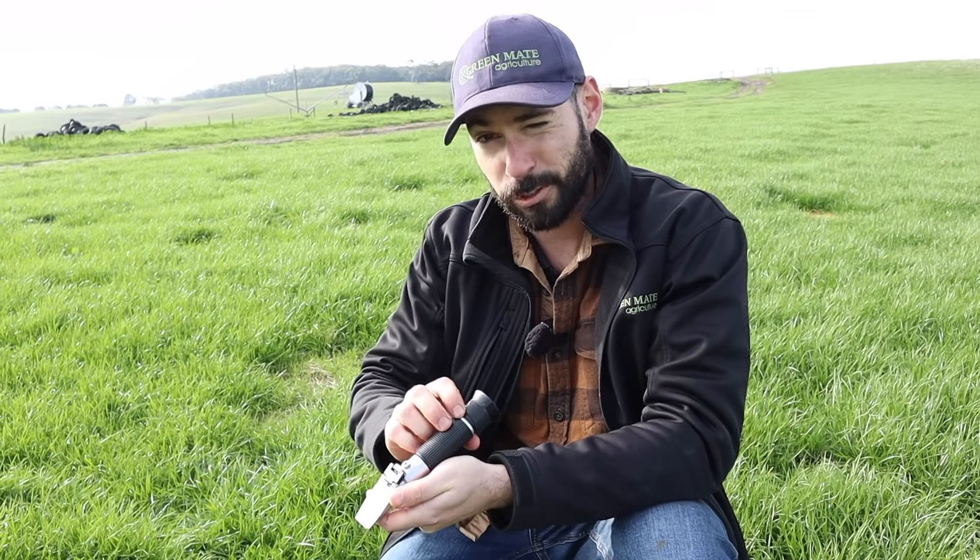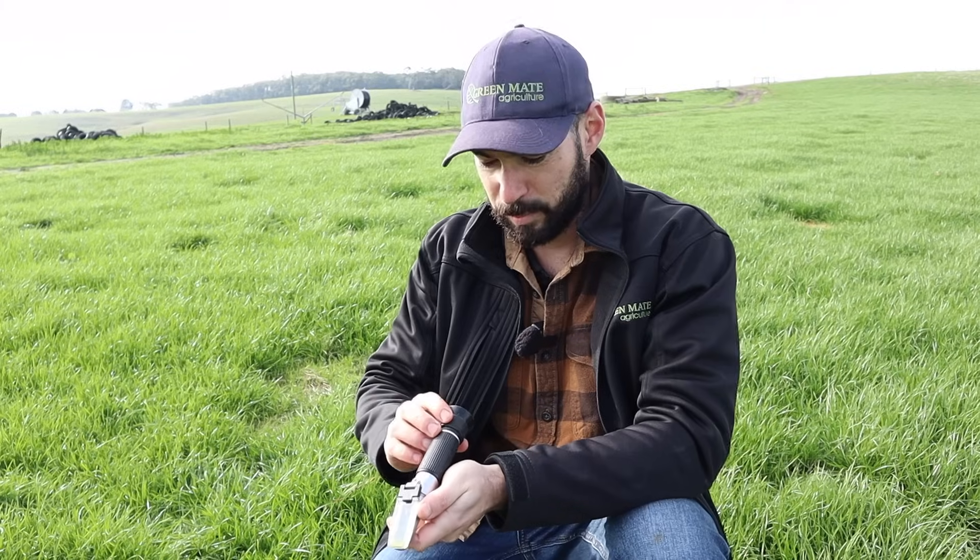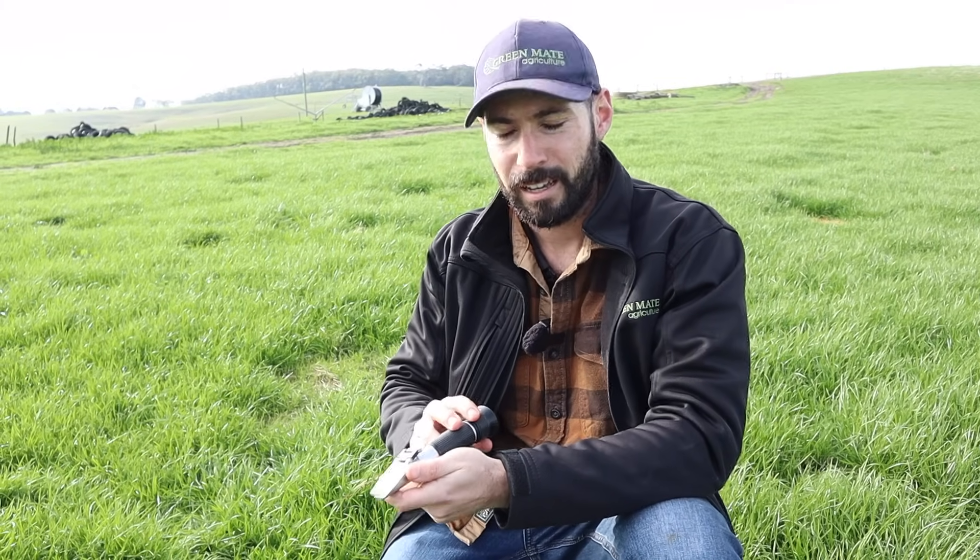We're looking through the refractometer now. Zero is just distilled water with no mineral or sugar in it. A stressed pasture — something that's under drought stress or water stress — is going to be down around 0.5 to 2 degrees brix. This sample is doing quite well; it's reading four and a half brix, which is really nice to see. It shows that there's sugar in the plant.